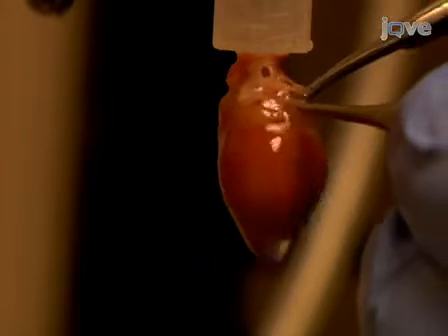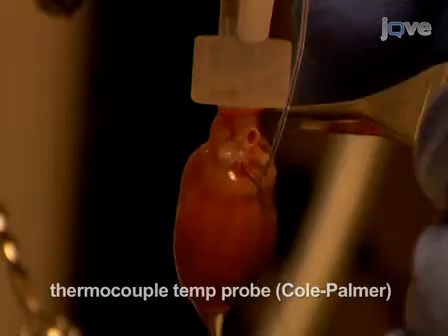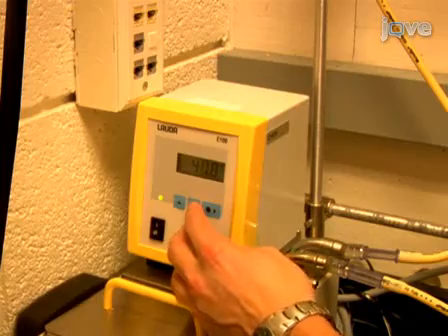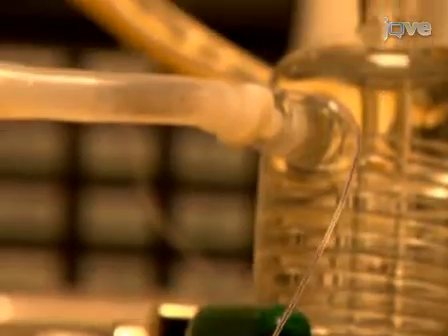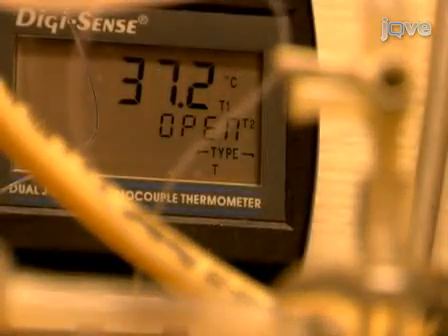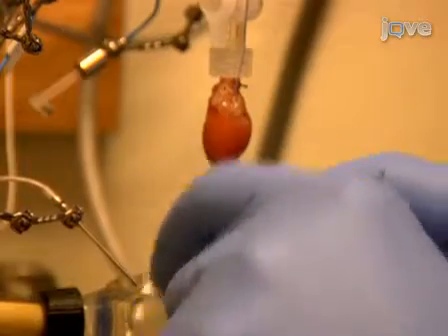As the heart is perfusing, introduce a very thin thermocouple temperature probe into the left ventricular cavity. Suture the probe in place with 5-O prolene sutures, and adjust the settings of the water circulatory pumps to maintain the temperature of the heart at 37 degrees Celsius. Minimize motion from the perfusate dripping from the cardiac apex by placing a piece of gauze in the effluent receptacle.